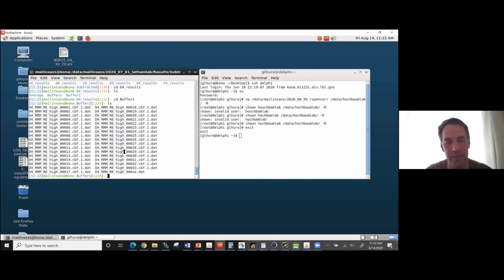And now you've got to go through a program that will help you figure out when radiation damage occurs. Now, I'm going to show you 3 ways of doing that. One way is to log into our system, and that's not the most convenient way because you have to log into our system. And unfortunately, the web version isn't working very well right now. So that's one of the reasons I'm giving you 3. We're going to fix the web version today, and I'll demo that for sure.